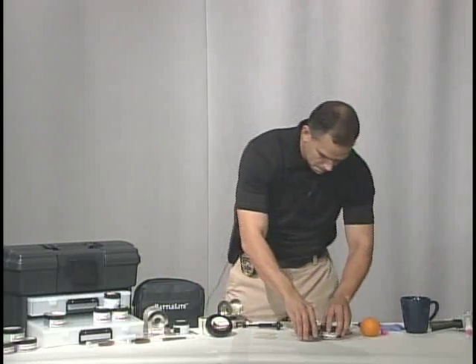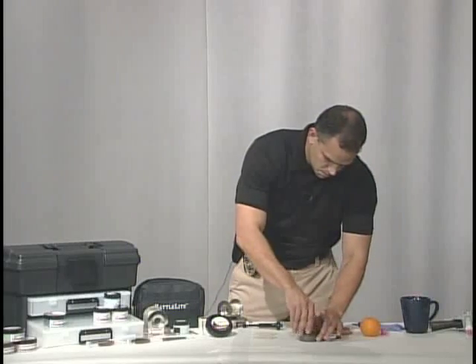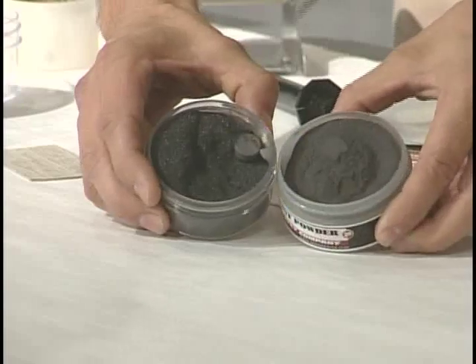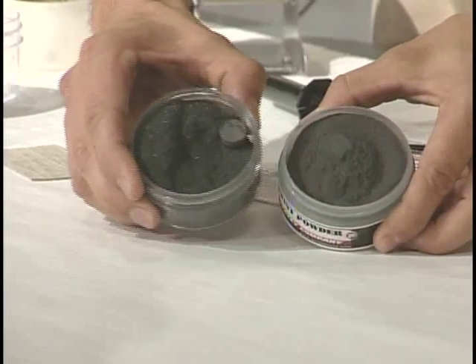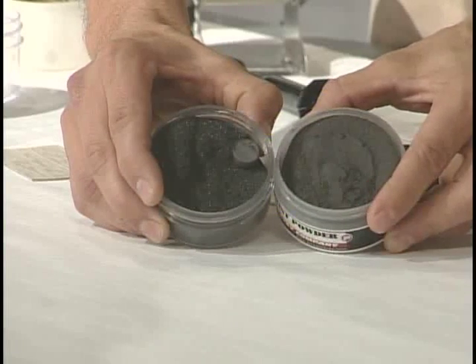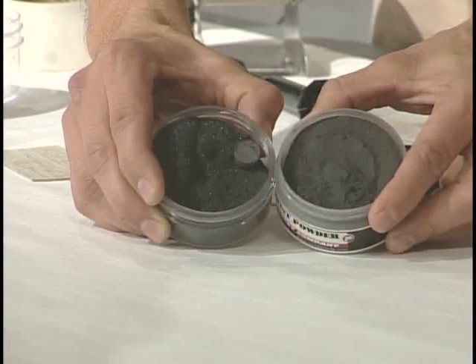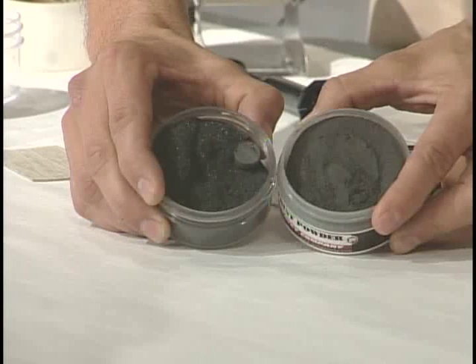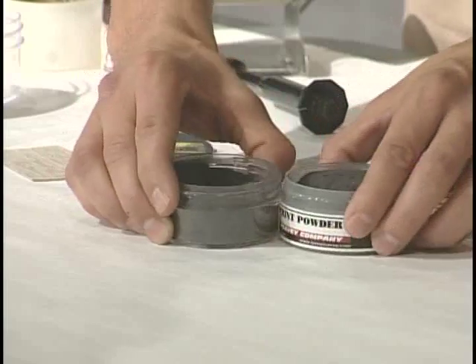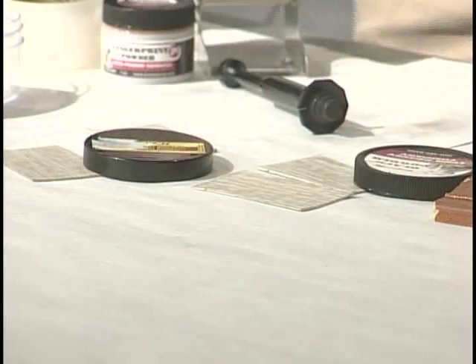Now, before we begin, I'm going to compare two different powders, because powders aren't created equal. If you look at the difference of these two powders, this powder here is much more coarse, and this powder here is much finer. The finer the powder, the better your fingerprint is going to be, because it's going to be the powder that's actually touching your print. So we want to make sure that we use the finest powder possible.